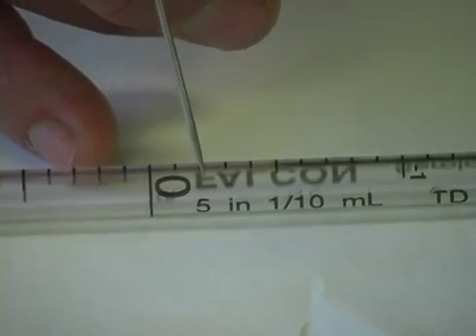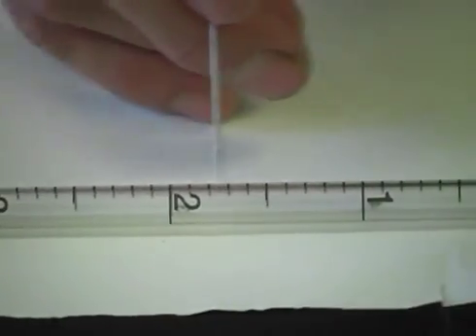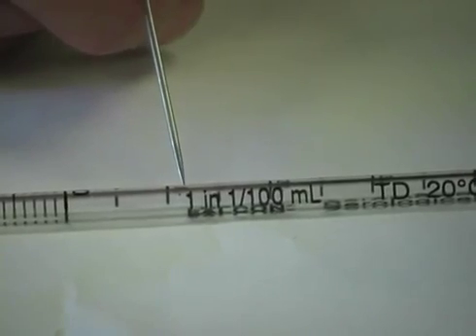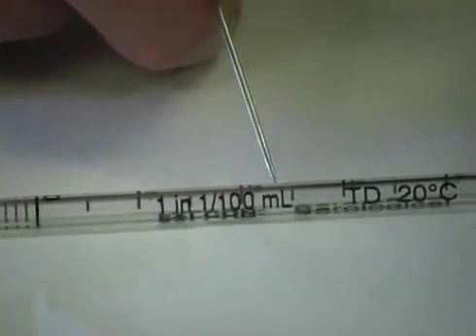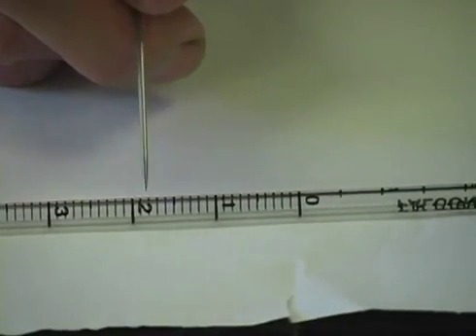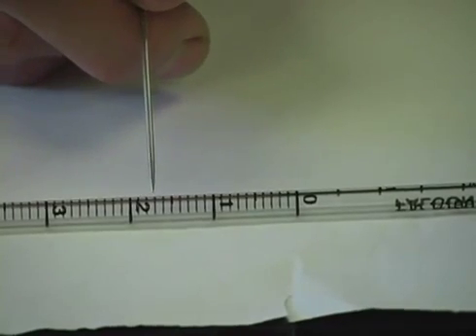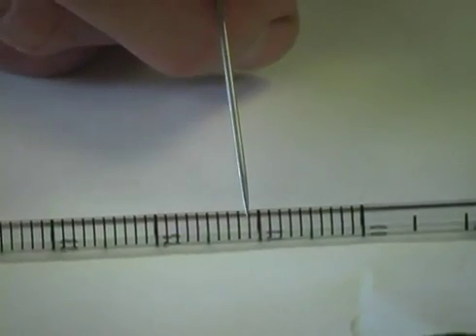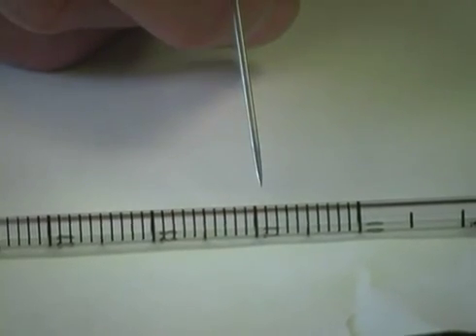On the 5 ml pipette, we see the values 5 and 1/10 ml. The volume between the major gradations is 1 ml. The volume of the minor gradations is 1/10. On the 1 ml serological pipette, the values are 1 and 1/100th ml. The volume between the major gradation lines here is 0.1 ml or 1/10 ml. The volume between the minor gradation lines here is 0.01 ml or 1/100th of a ml.